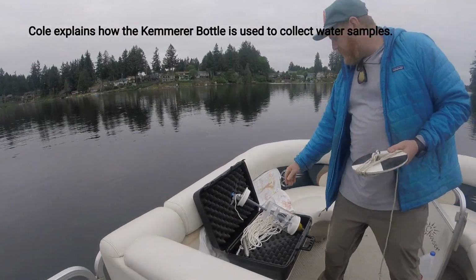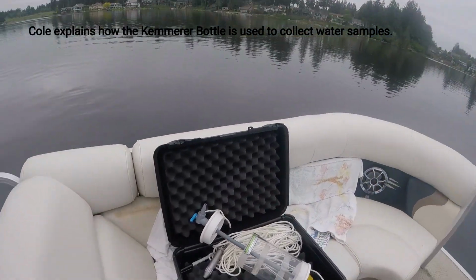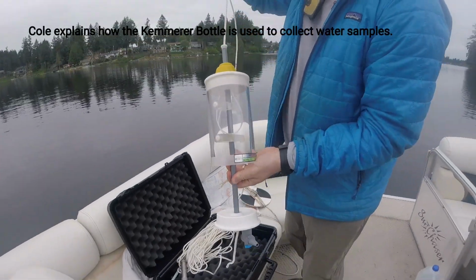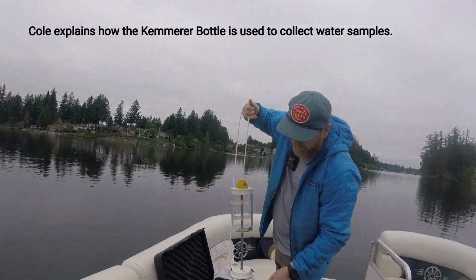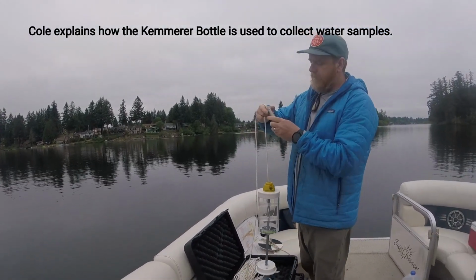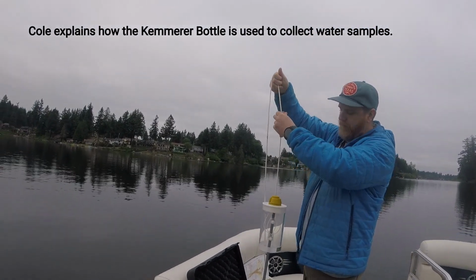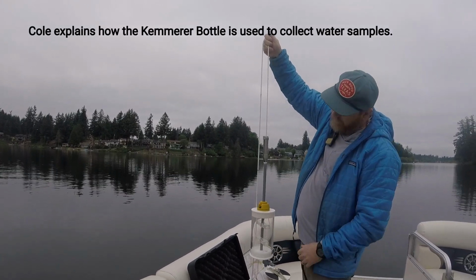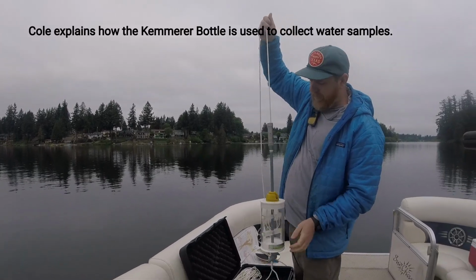This, I believe, is a Kemmerer water sampler. Okay. So what happens is you lower it down to the depth that you want to sample, you've got this catch right here, and then you have this thing called a messenger. Then it pops it and closes it, captures the water, you bring it up, and then you can release the water into whatever.